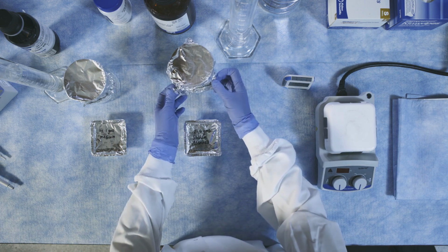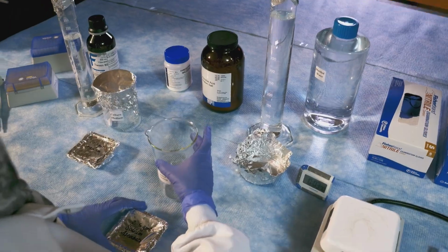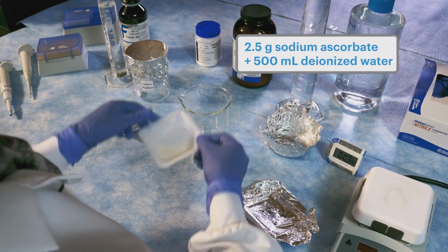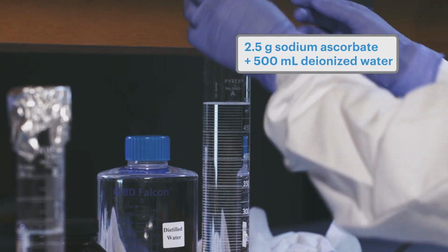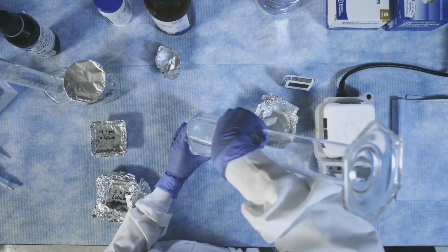2 reagents need to be prepared freshly for each run. First, the sodium ascorbate. To prepare a 0.5% solution, add 2.5 grams of sodium ascorbate to a 500 milliliter beaker and dissolve with 500 milliliters of deionized water.